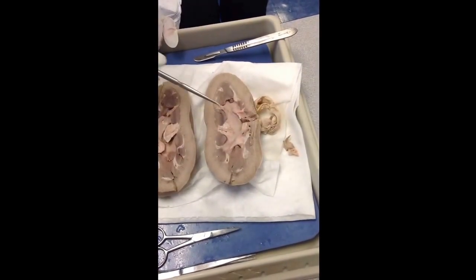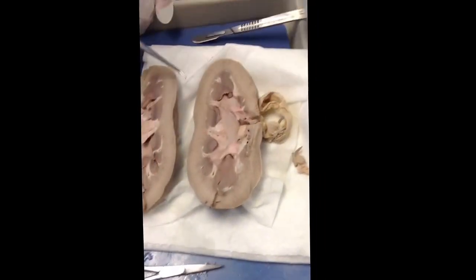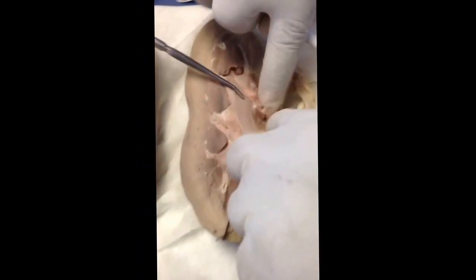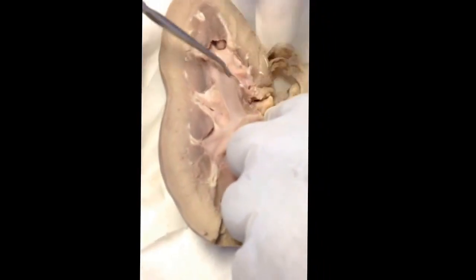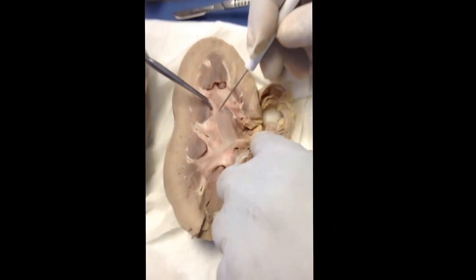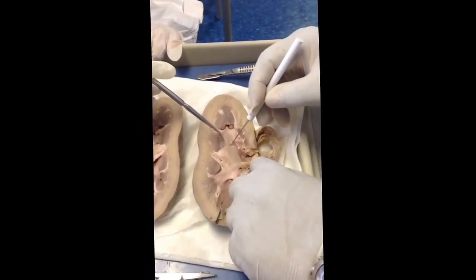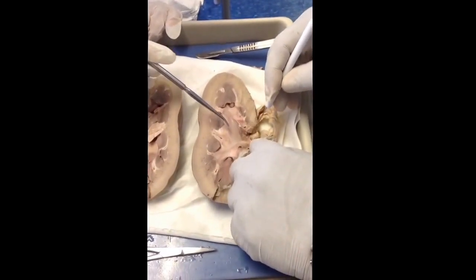So you guys follow the lineup and identify these things. Which one was the renal pelvis? Here. That one? Right here. And that leads to the ureter. The ureter that drains out. And then this is the major, right? No, at one point, here, where you have this draining in here, this draining here, that's the minor calyx. Minor, major. Right here, pelvis, and then you are going into your ureter.